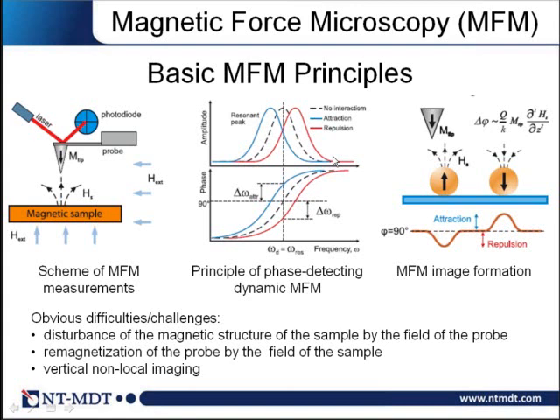Since it's a permanent magnet, and if you take care of this magnet, not hitting it too much, not letting it fall down, this magnetic field is stable. Once calibrated, once measured, you can be sure that the magnetic field is well known.